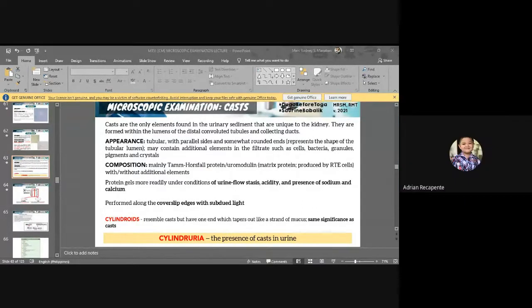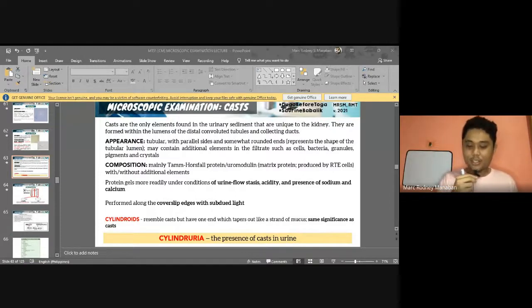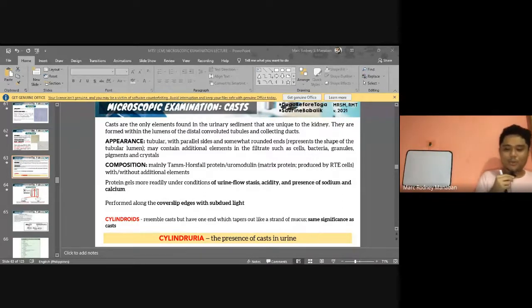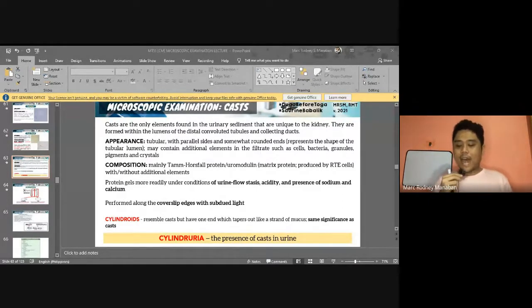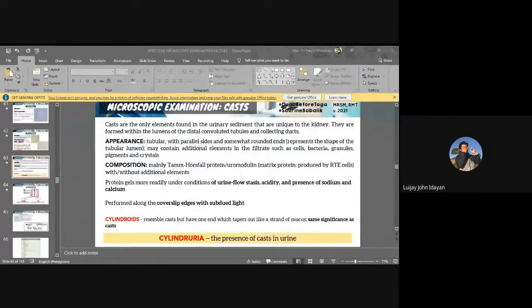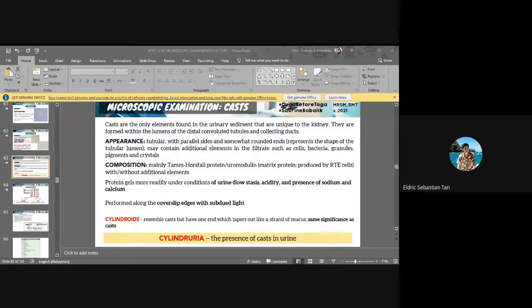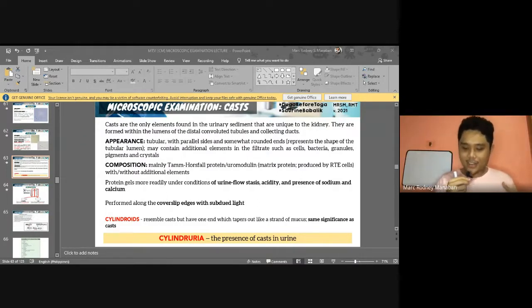What is it, Aid? Mucus, sir. Mucus. Okay, Eldrick, what is your answer? Mucus, sir. Okay, very good. Mucus threads. Lou J, since you raised your hand, do mucus threads have significance or not? None, sir. Sure? Okay. Do you agree with Lou J's answer? Do mucus threads have no significance? Yes, sir. Okay, final answer?